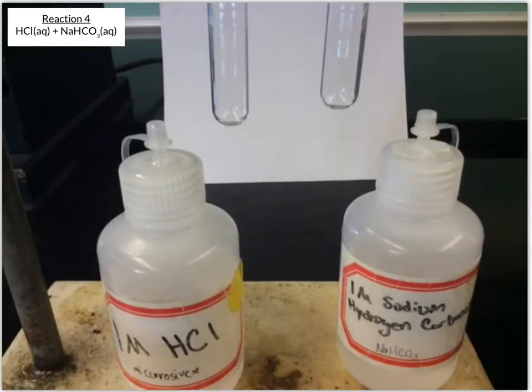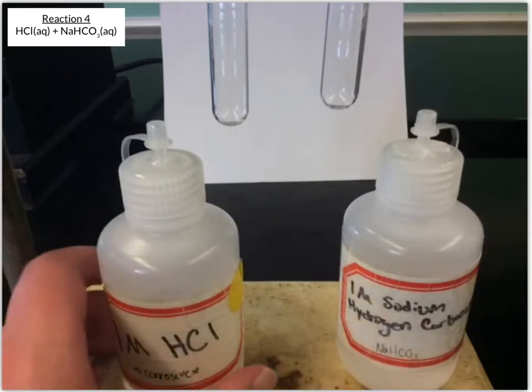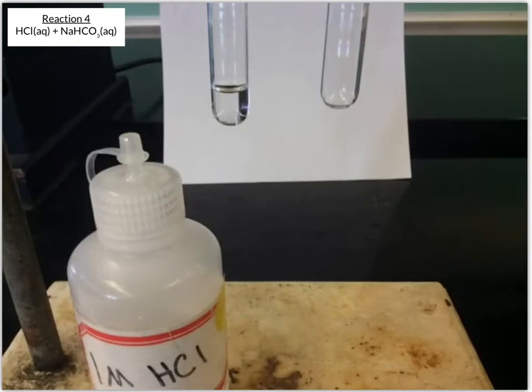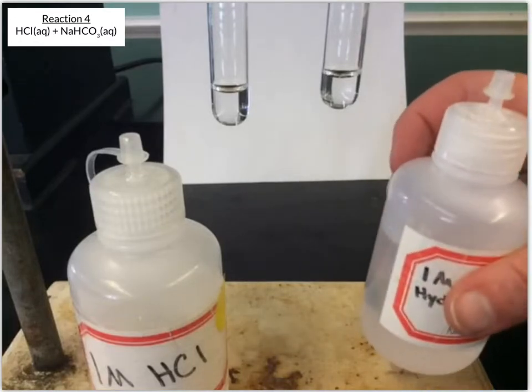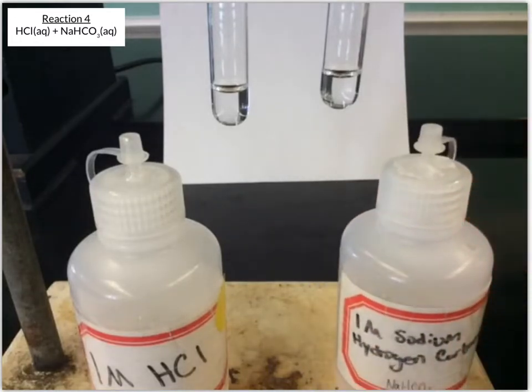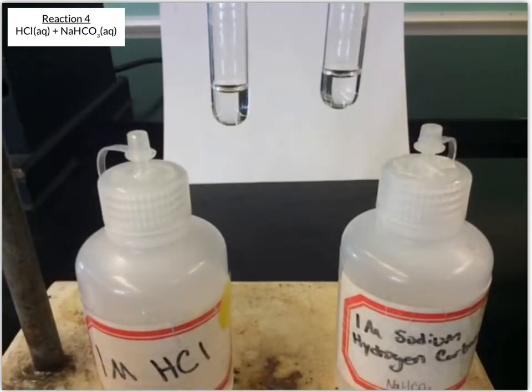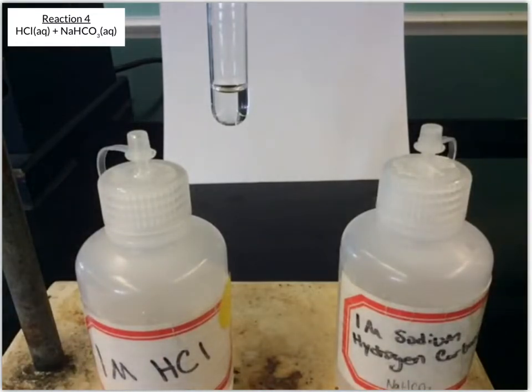For the fourth reaction, we're going to react HCl, or hydrochloric acid, with sodium hydrogen carbonate, which is NaHCO3. And so again, we'll take about 1 milliliter of each of these solutions. And as always, you should make note of what these solutions look like to start with, which they're both clear colorless solutions. And I'm going to take the sodium hydrogen carbonate, or sodium bicarbonate, and pour that into the HCl and see what happens.